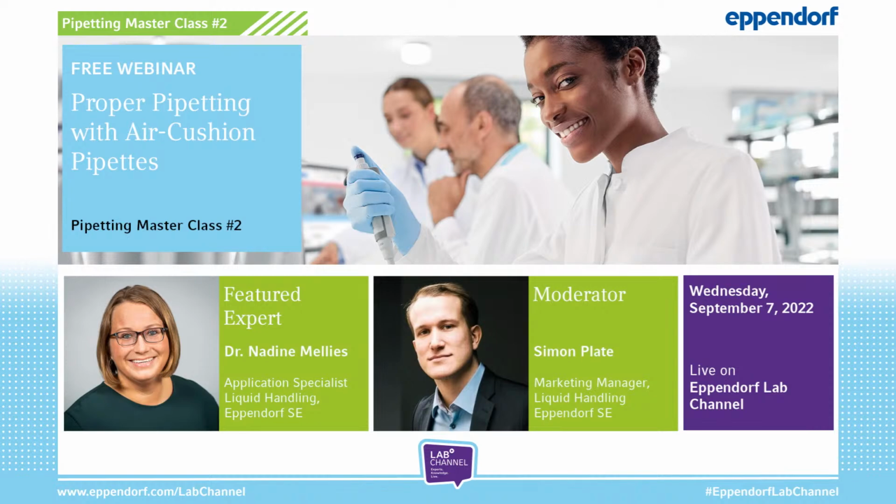The title of our webinar today is Proper Pipetting with Air Cushion Pipettes. And in the next 30 to 40 minutes, you'll learn what to keep in mind when pipetting with air cushion pipettes, how to avoid typical pitfalls and increase your pipetting performance in the lab, and why pipettes and pipette tips need to be considered as a liquid handling system.